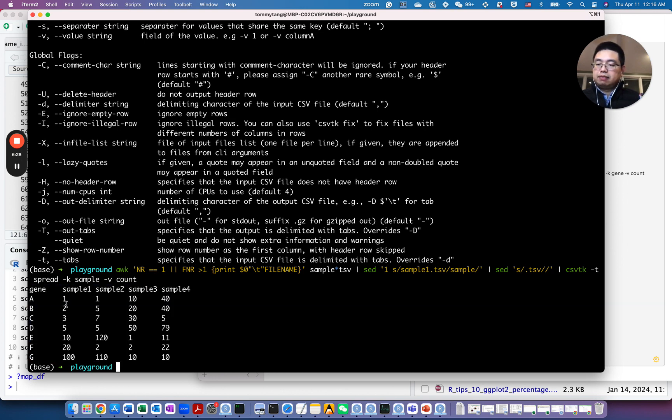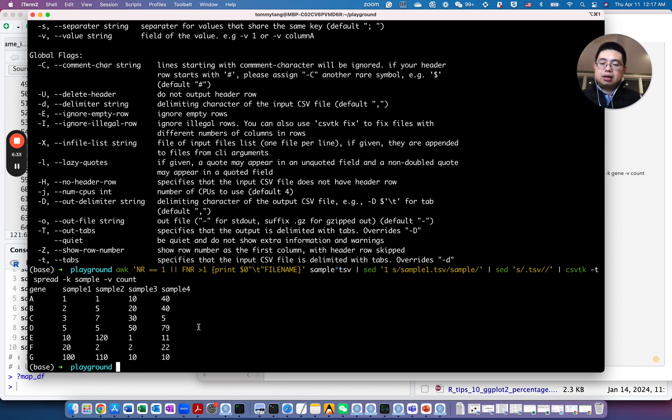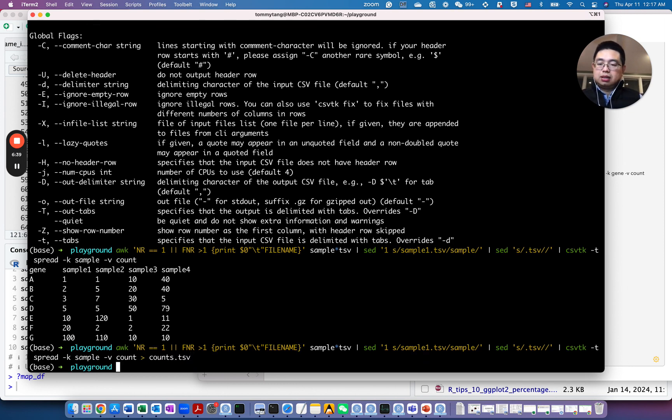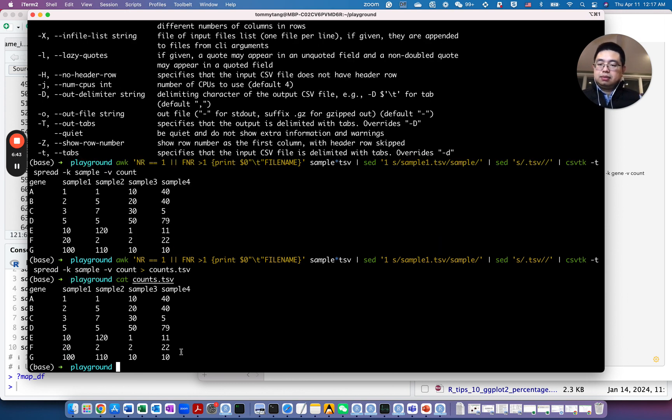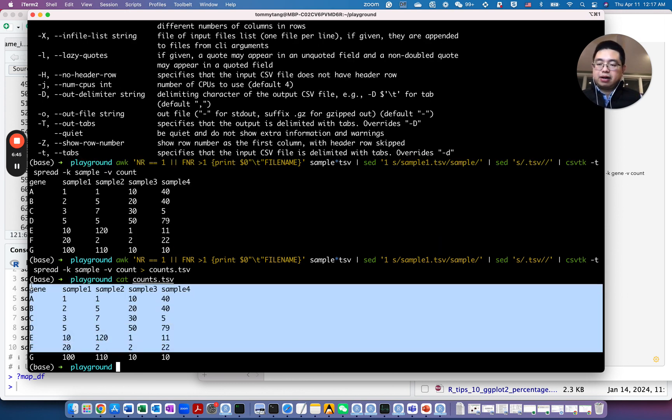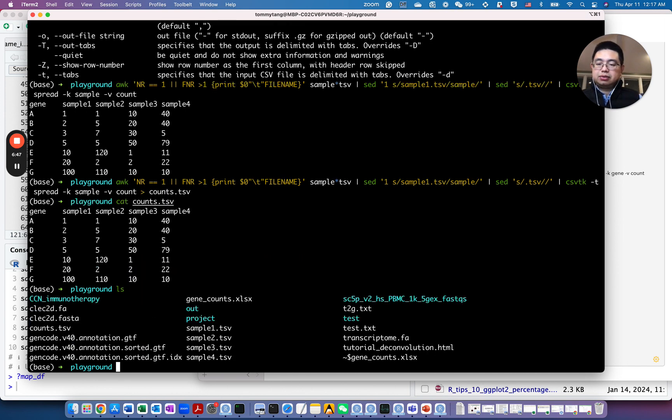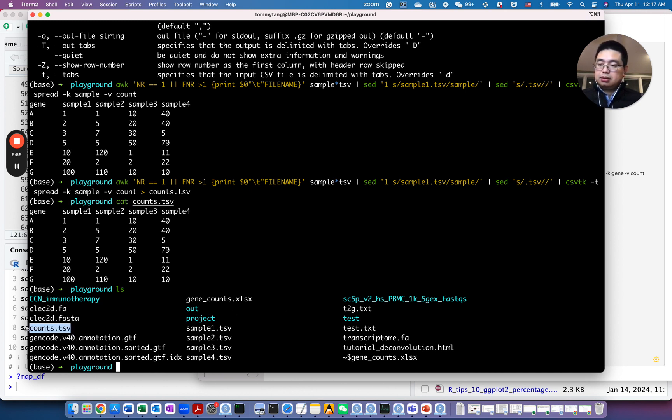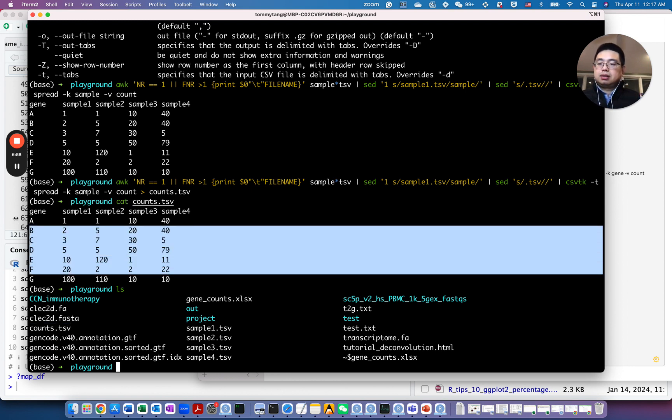So now we have this count matrix, right? Rows are genes, columns are the samples. So after you do this, you can just save it into counts.csv. And then let's look at the counts. So now you have a file in your file system here called counts.csv. It's here.